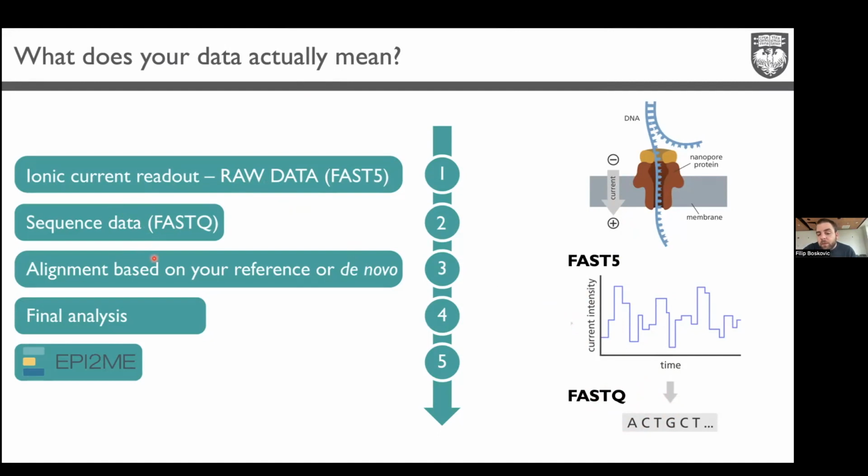And one good thing about Oxford Nanopore, I think they're really good, is their protocols are very detailed, very nicely explained. You have even pictures showing how to hold your pipette, how to switch, and so on. So it's really made to the details. Of course, from people that I heard, I should not say more, maybe customer service is not that responsive as for Illumina, but I think that's just their business model.